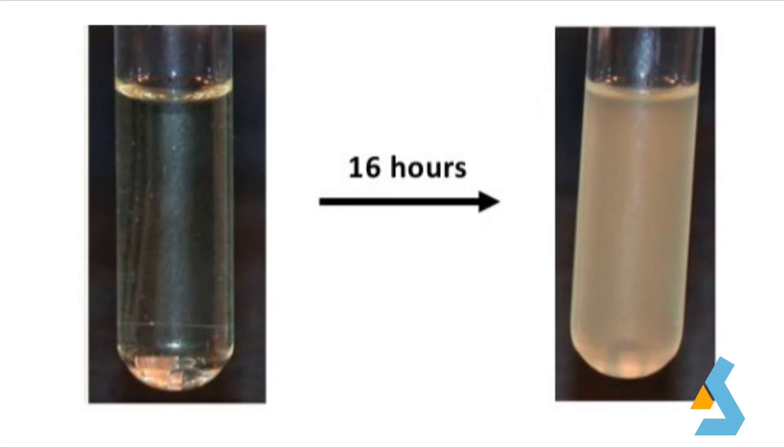After overnight growth, first we must check the turbidity of media to see whether the bacteria have grown or not. If the tube remained like the one on the left, it means that bacteria did not grow and we cannot isolate DNA. If bacteria grow, the culture should look blurry as in the right one.